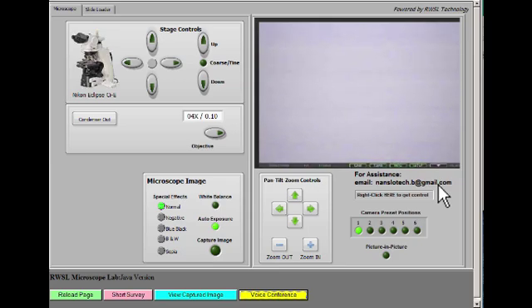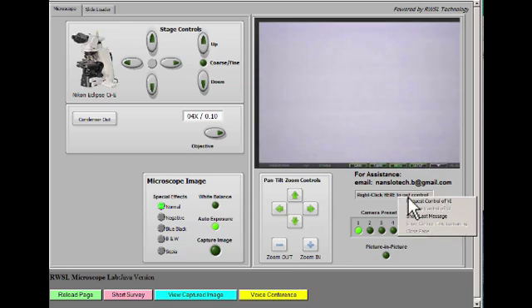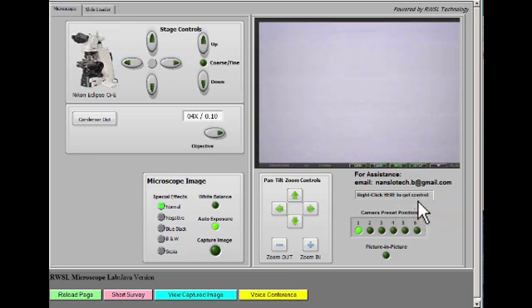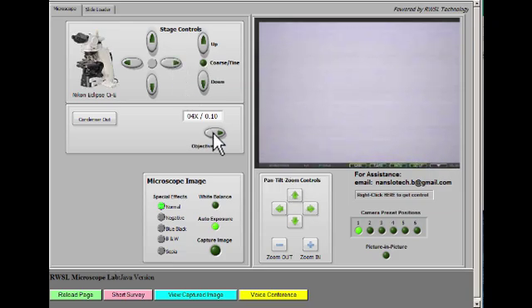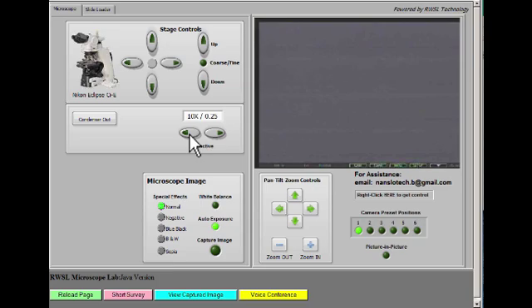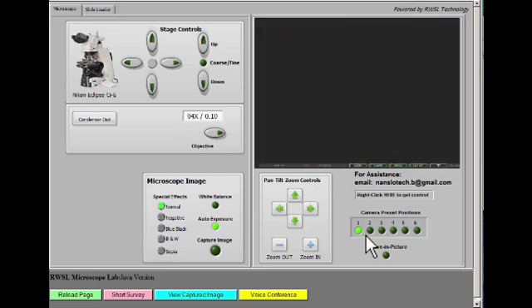Only one person can be in control of the interface at a given time, so just right-click on the desktop and select Request Control of VI. If you're the first to do this, the buttons will now respond to you.